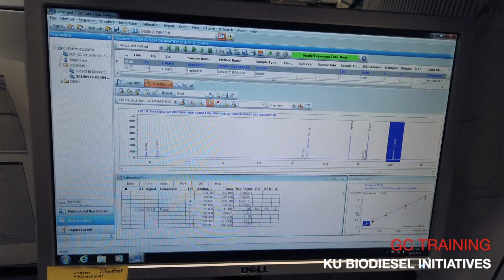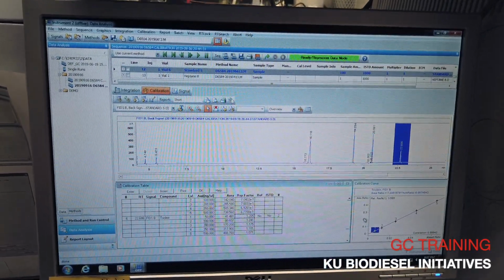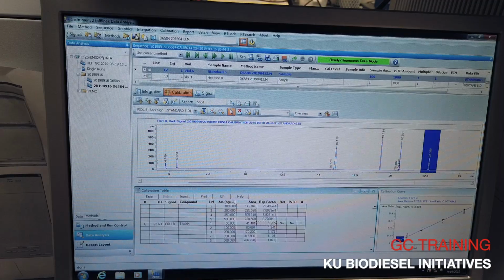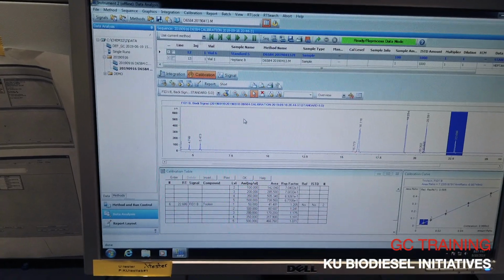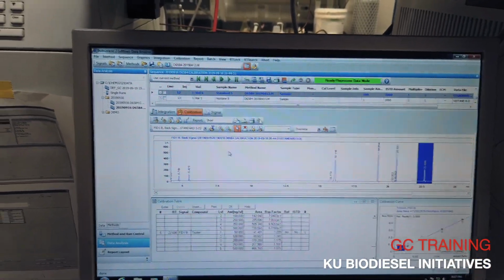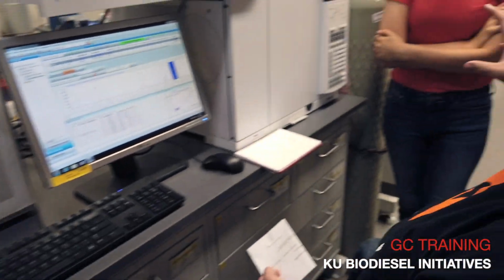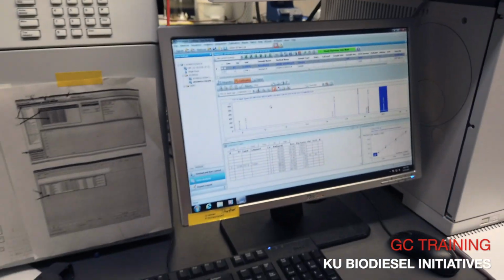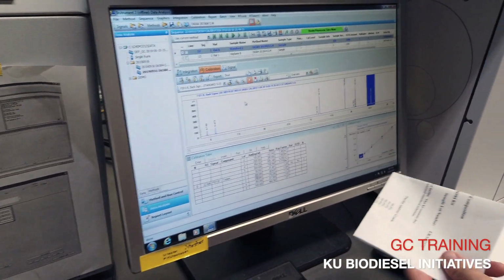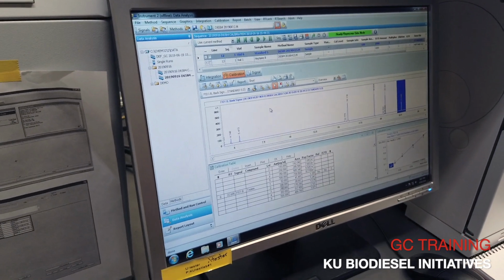So yeah, the real test is going to be when we can actually go in and do a sample, because then we can go in and refine it. After this, we'll need to find a time to run and do the QC. Since you guys have watched me do it, basically all we'll do is measure out in a file, go through and do what I showed you during the calibration, and then we'll run it, modify the free glycerin, and then do that analysis. And then once that passes, you can start running.